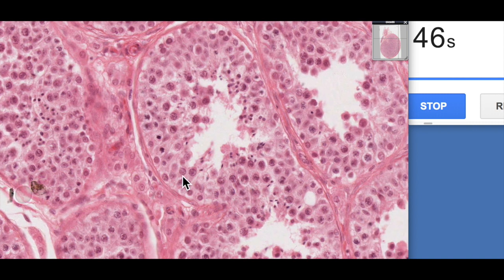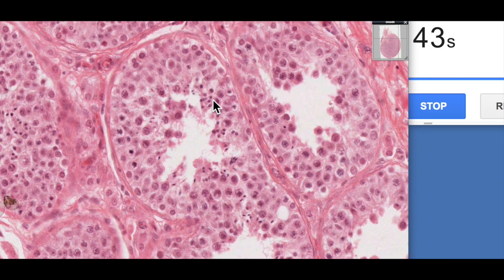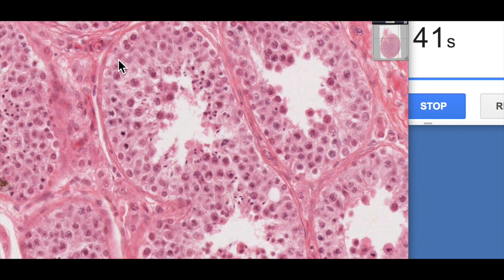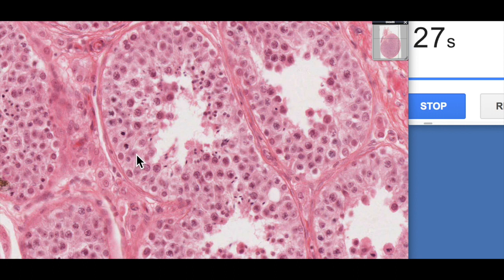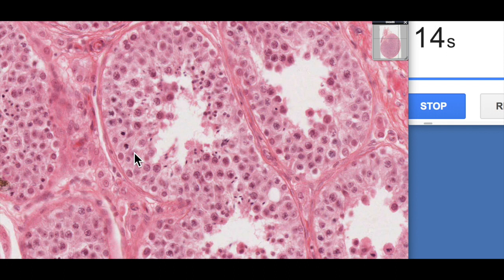The testis has two main functions: the production of gametes in the form of spermatozoa, and the production of sex hormones, particularly testosterone. Here we've got the seminiferous tubules sitting on a basement membrane, with cells at various stages of meiosis, as well as somatic cells — also known as sustentacular cells or Sertoli cells. Sertoli cells envelop the spermatozoa and help the sperm progress through spermatogenesis. They have receptors for follicle stimulating hormone, FSH, which stimulates spermatogenesis and causes them to produce testicular fluid to help move the sperm through.